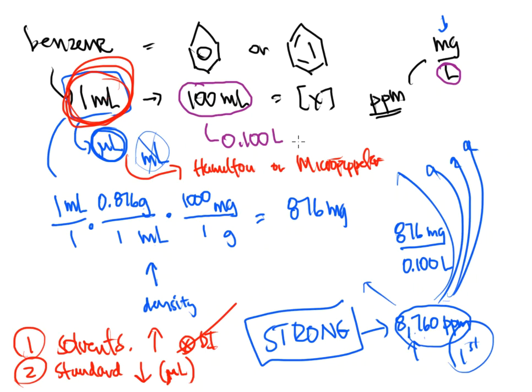All right, so that's my word of advice to you about standard prep. Pretty important, kind of different than what you've done before up to this point, but this is the way it is. So get ready to eat through and drink through 4 liters of acetone or methanol because you're going to need it. And you can imagine our perspective. If you've got 10, 20 people in the lab that are all doing it, we're going to go through 10 liters of stuff before your sample standard sets are going to be made.